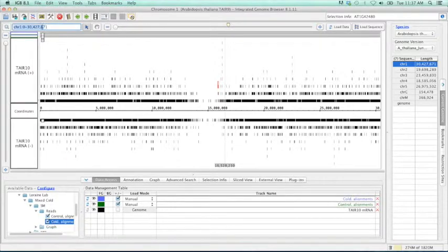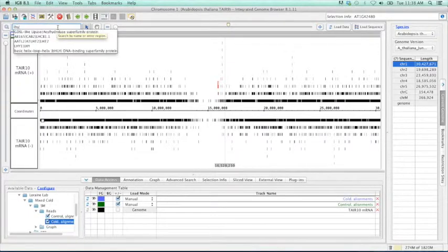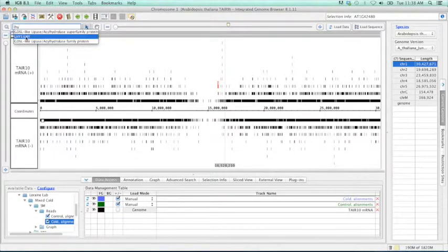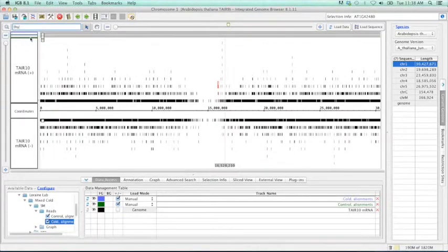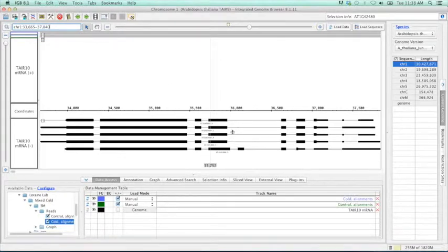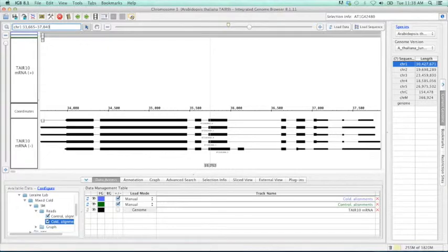Our analysis has indicated that we have a gene of interest that is very important to our model organism. So let's do a search for the LHY gene. Up here in the search bar, I'm just going to type in LHY. This is going to identify right here, LHY1 or LHY. Click on it, and it should take us to the LHY gene model. As you can see here, there appears to be five different gene models for LHY, and they all appear on the minus strand.